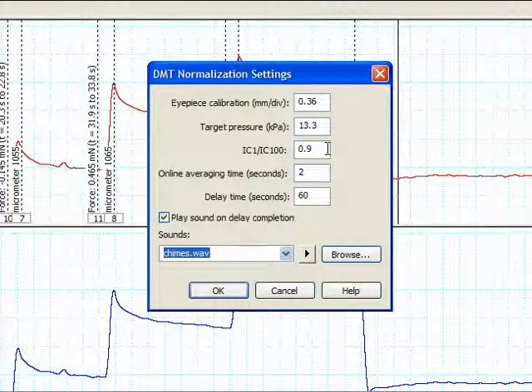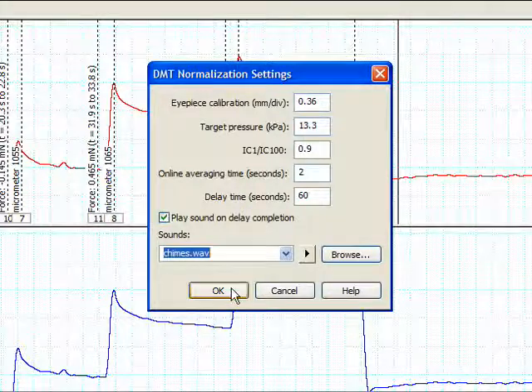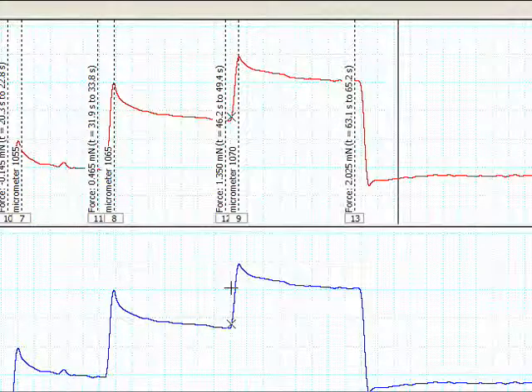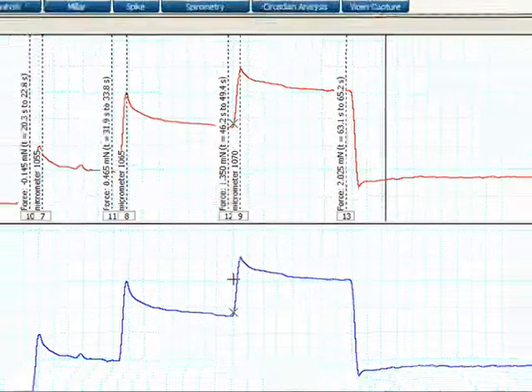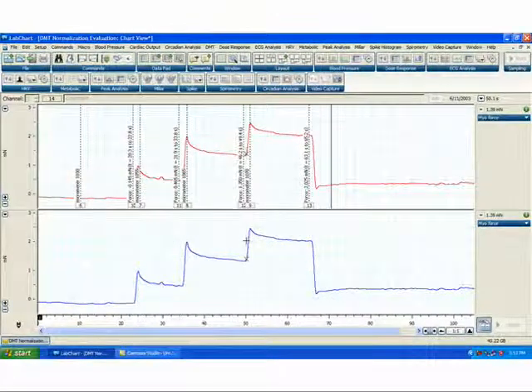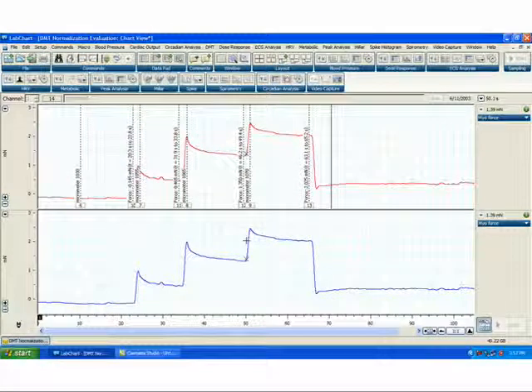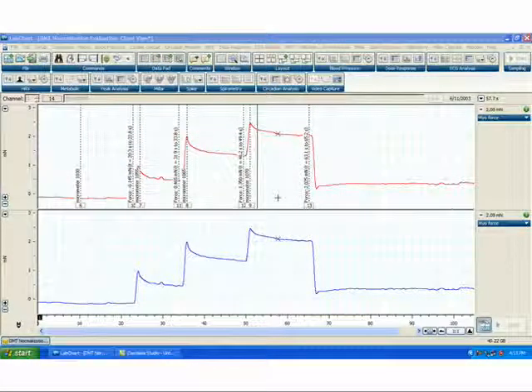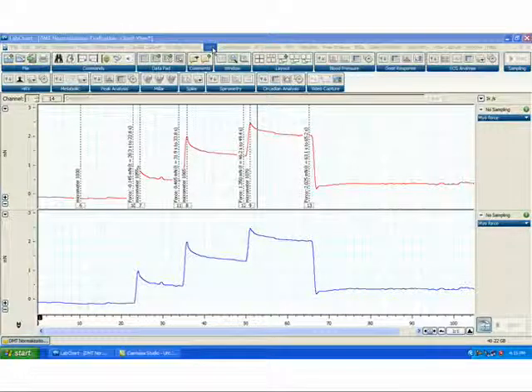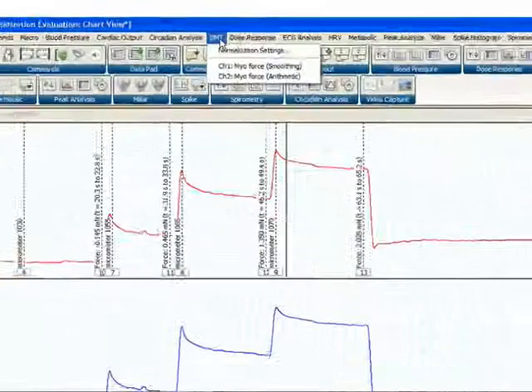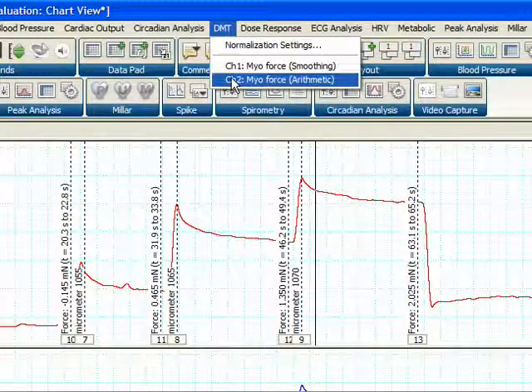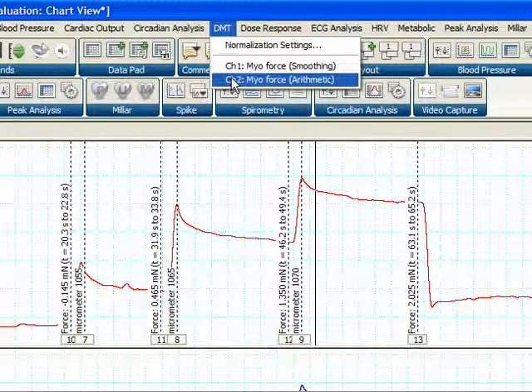Once you have configured the DMT normalization settings, we can click OK, and it would be most convenient for you to save them in a LabChart settings file so you do not have to work with them daily. Although you will not be working with the DMT normalization settings on a daily basis, you will need to perform DMT normalization on each channel with each experiment.